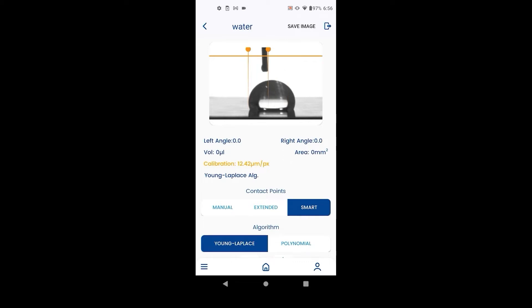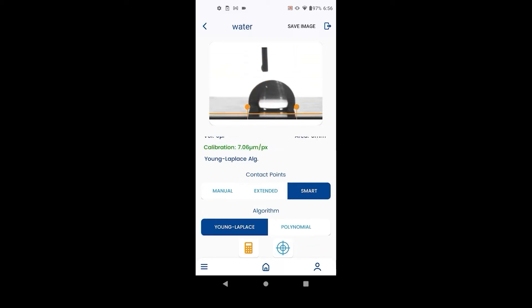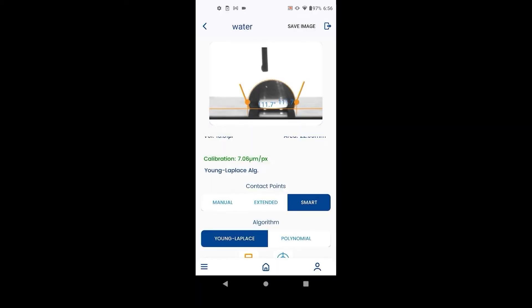Move the orange points to the left and right of the needle and hit calibrate — an initial estimate is enough. If the calibration number is green, then the number is correct. If it is red or yellow, then something is wrong. We suggest you recheck the diameter of the needle in the project screen and redo the calibration process. Generally, the lower the calibration number, the better.